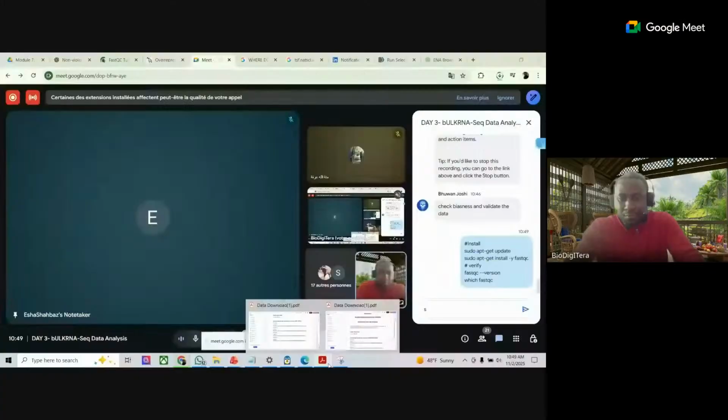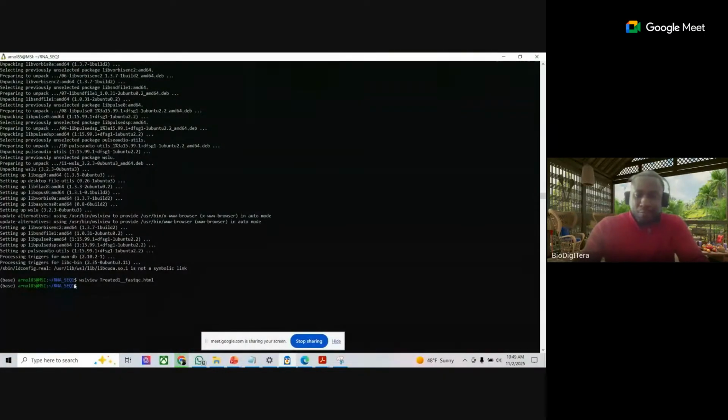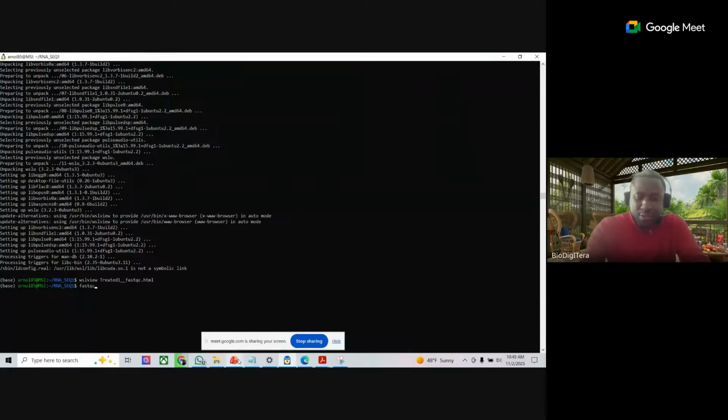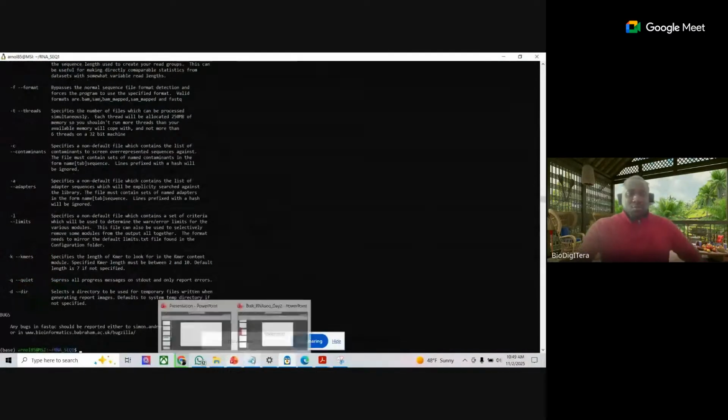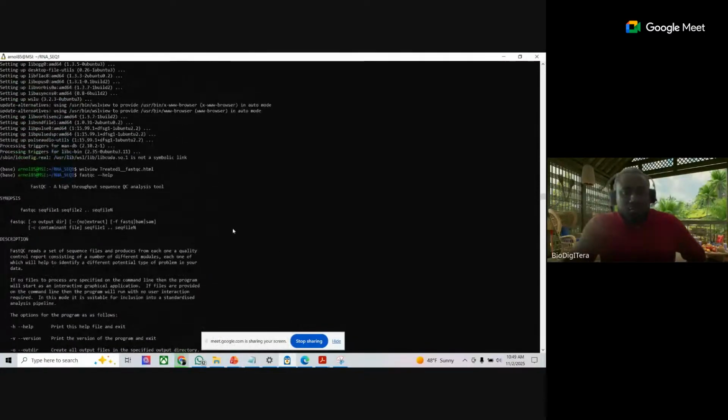Is it okay? Okay, guys, type fastqc help. Let me share it with you. Did you see? Can you copy?